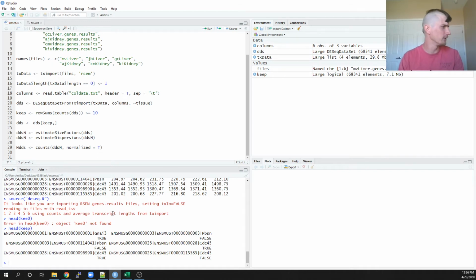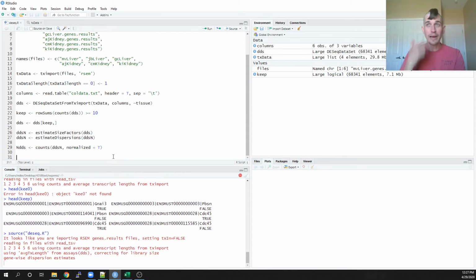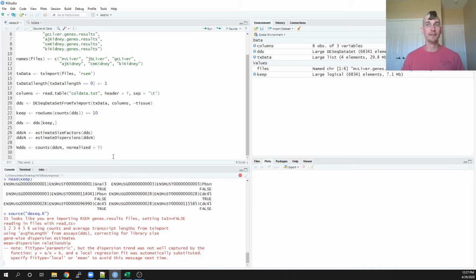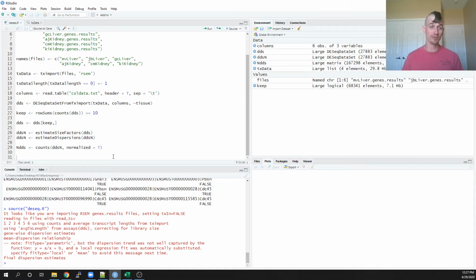So I'm just going to save all this stuff real quick and run it again. While that's running, I can save this matrix. It will ultimately be a resulting transformed matrix that I may actually want to visualize later. I may want to make some graphs off of those numbers later.